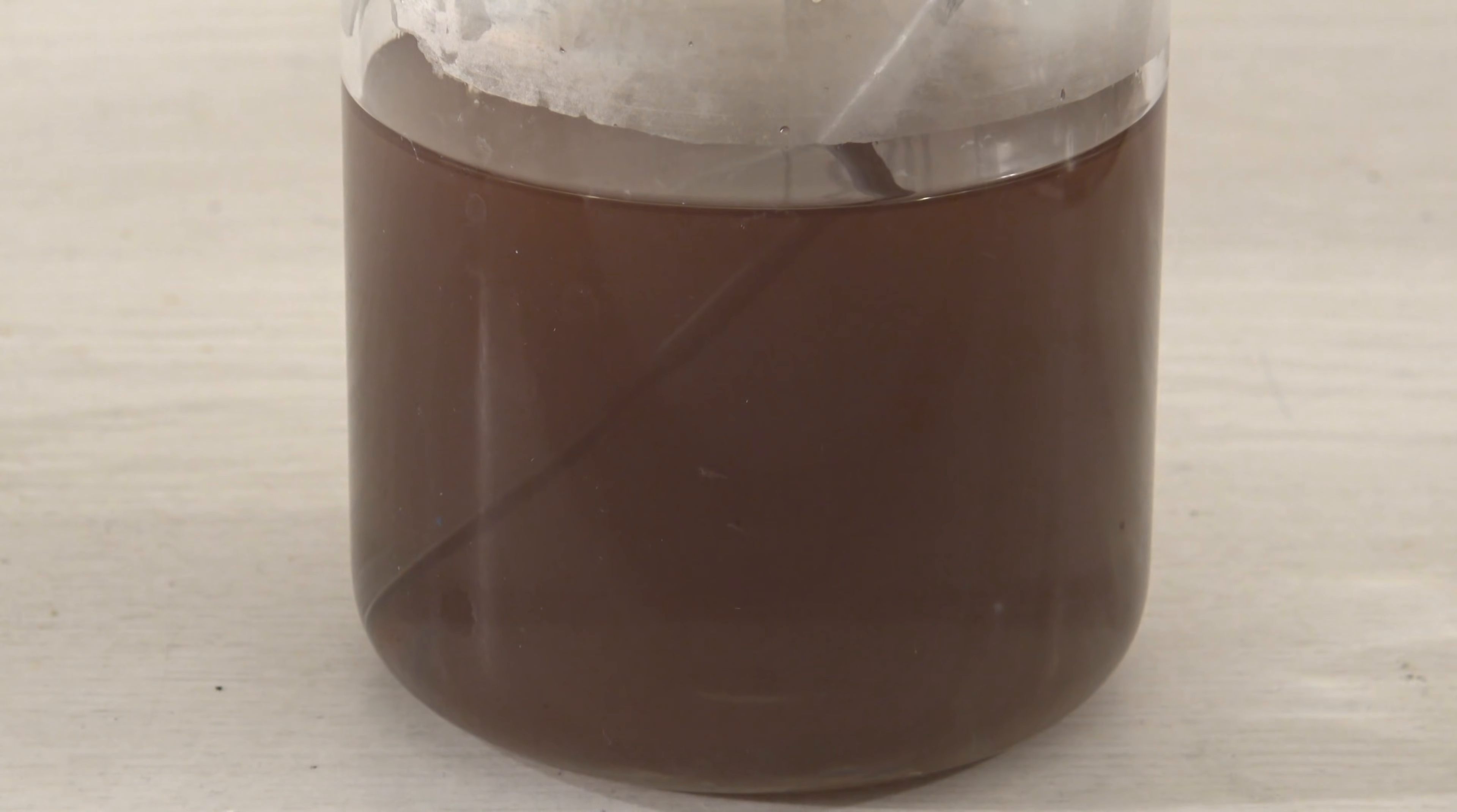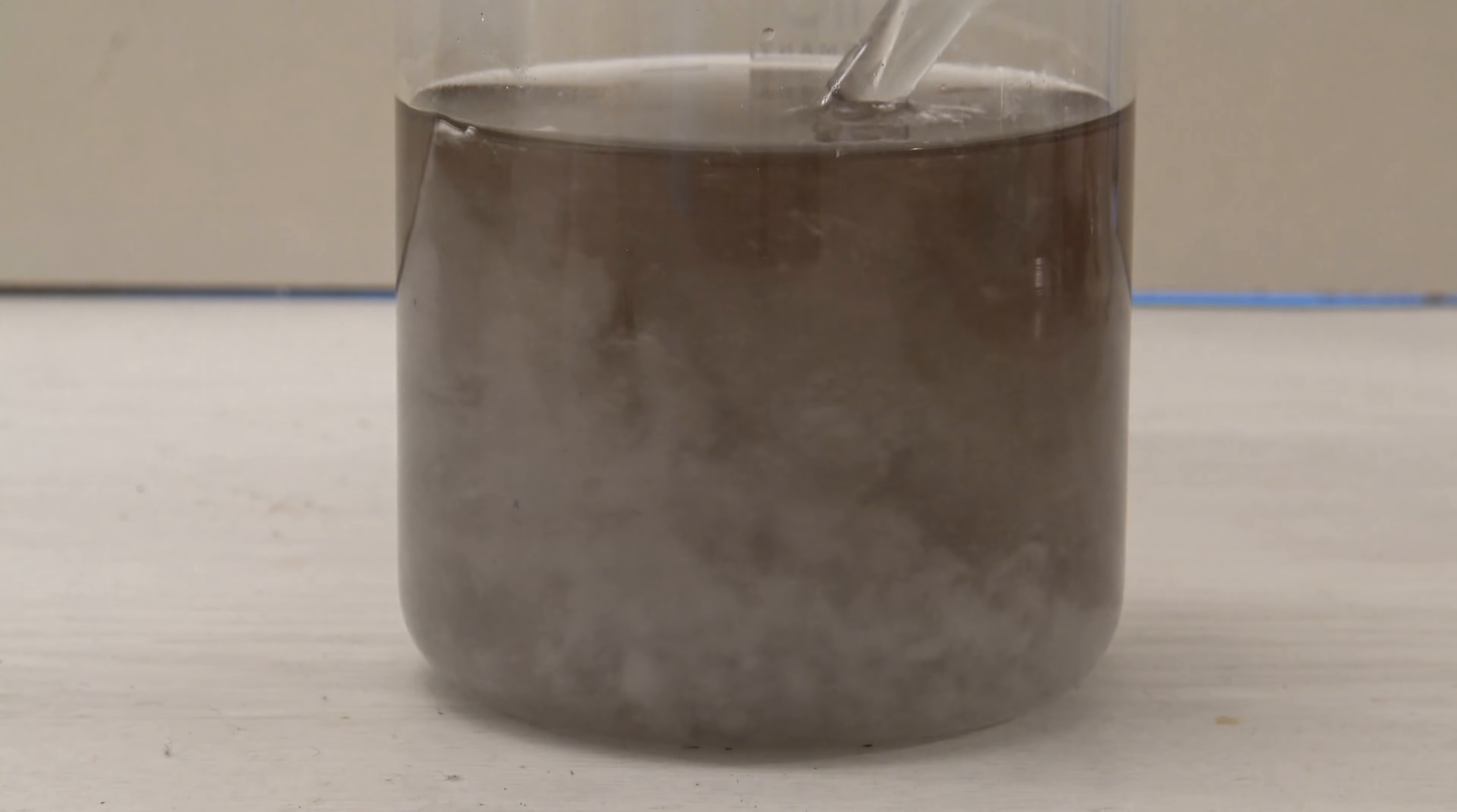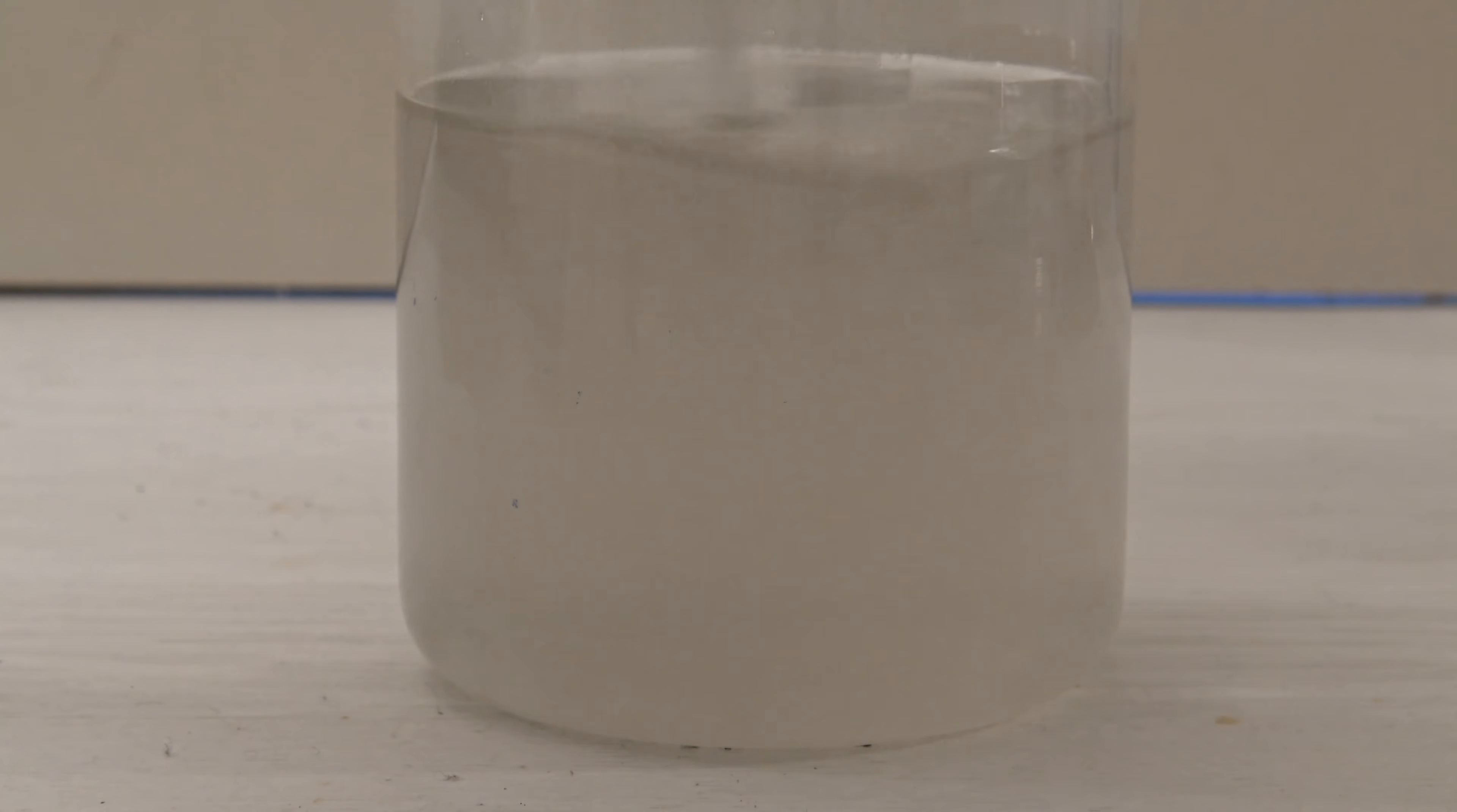To get the benzoic acid out of the solution and reduce the manganese dioxide, 45 milliliters of 1 molar sulfuric acid were added. This protonates the benzoic acid, which is poorly soluble in this form and precipitates. The acid was added in portions, so the manganese dioxide was reduced before the benzoic acid did precipitate, otherwise inclusions might be present in the product.